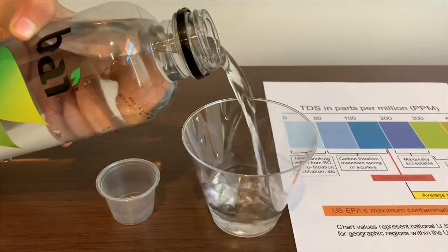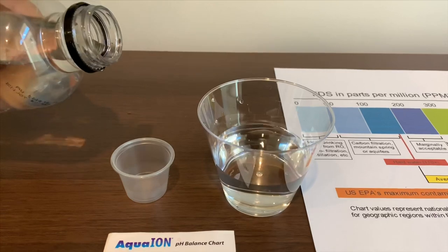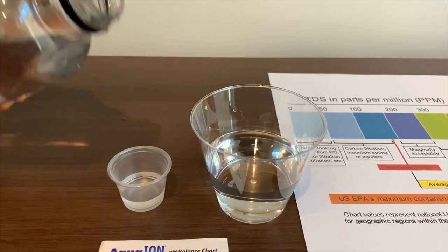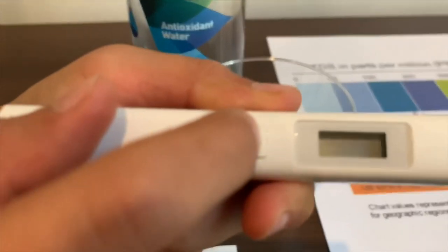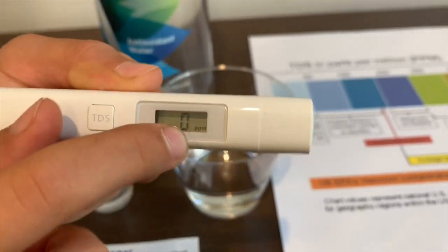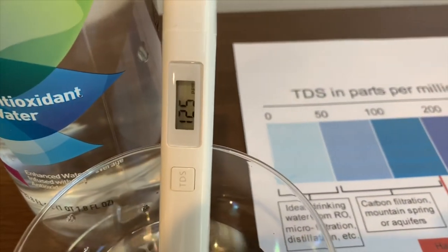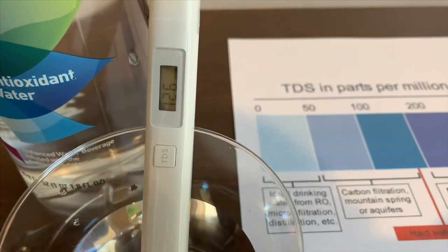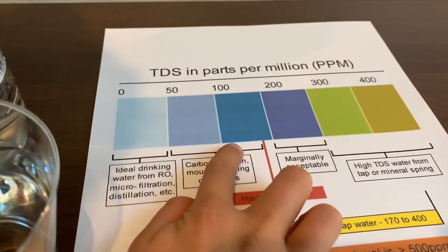Let's pour some water in. First, we're going to test the TDS level. Turn on the TDS Tester, make sure it says 0, and let's put it in. 126. That's okay to drink.